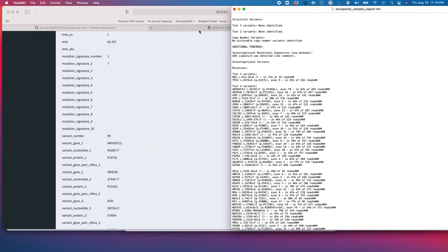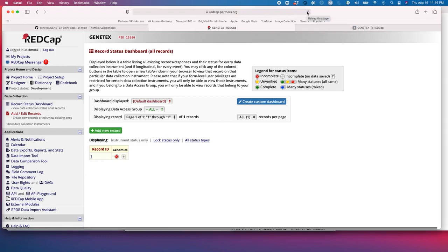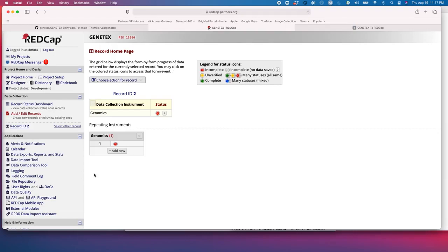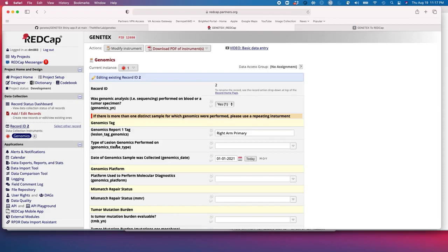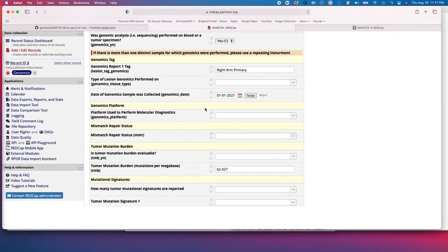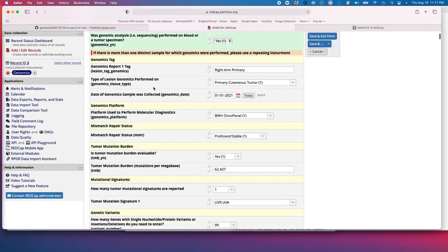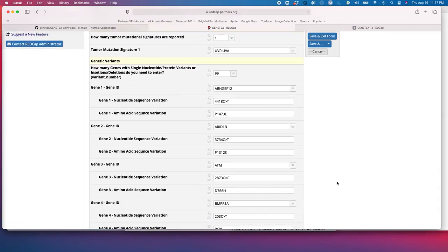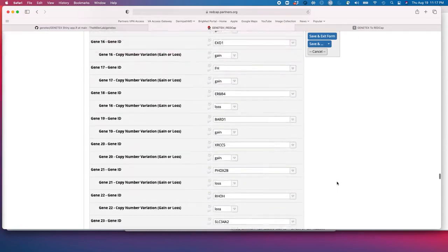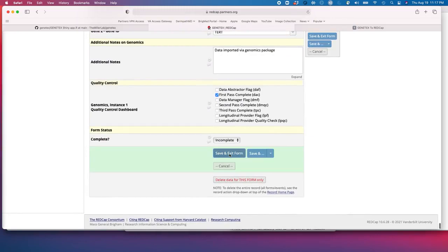After we've captured that and run Genetix to REDCap, we go to the REDCap project. After refreshing the browser, instead of having one record, we now have two records — that information was sent through the API into REDCap. The information from that data frame has been transmitted to our genomics instrument. We see the information captured: a right arm primary lesion captured on January 1st, 2021, the lesion type, the genomics platform used — Oncopanel — and importantly, all of the genes and genetic variants that were captured. You can use this as another opportunity for quality control, and after confirming the information is accurate, you can save and exit the form.